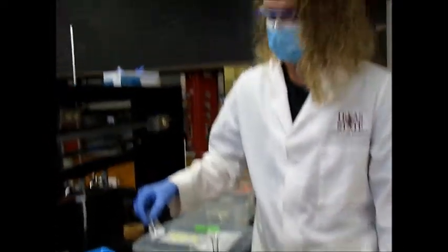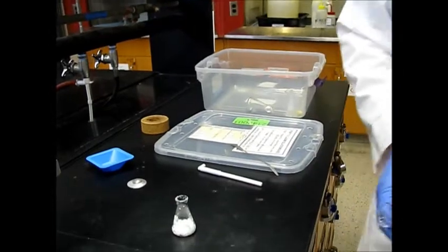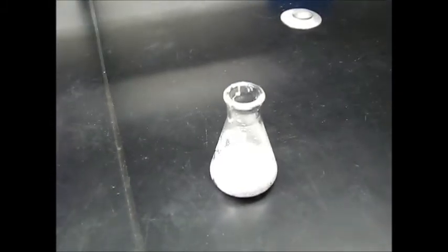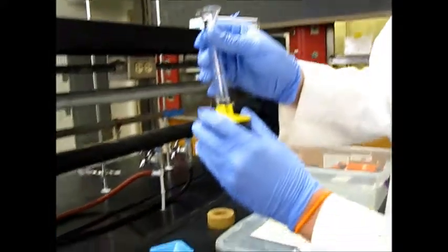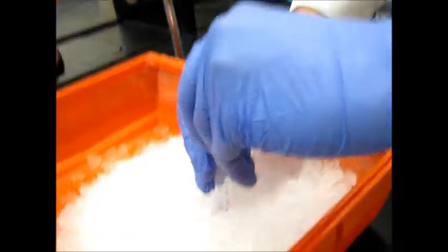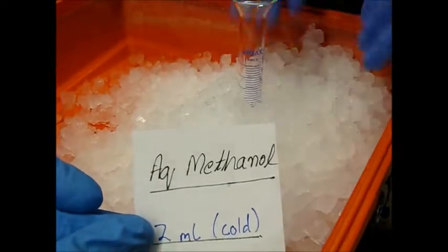So we're ready for the final step of the workup, which is the vacuum filtration. Before we do that, I'm going to grab 2 milliliters of methanol and set it in the ice so that it's nice and cold for whenever we need it. What we can do is take off this base part and set this directly into the ice. I want to make sure that it's nice and supported, but it doesn't tip over. Awesome. So we'll let that chill out for a while.